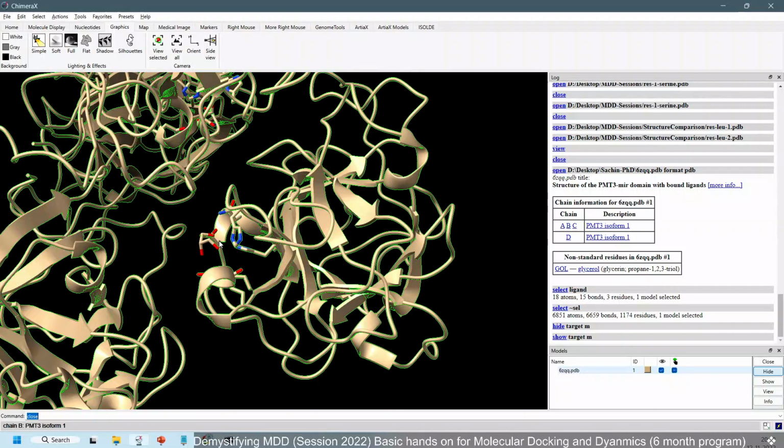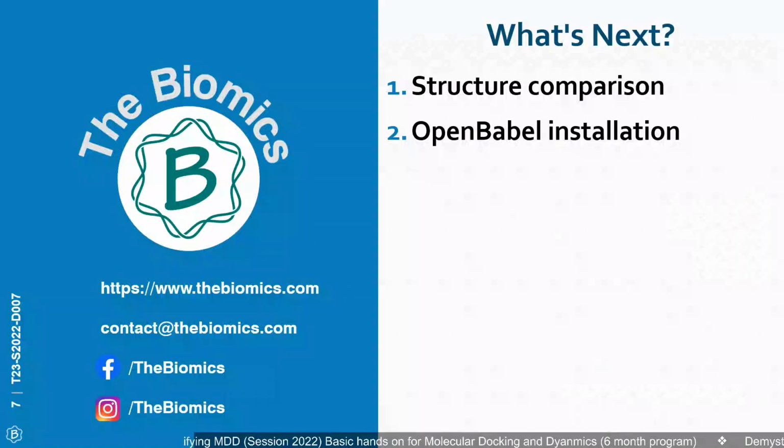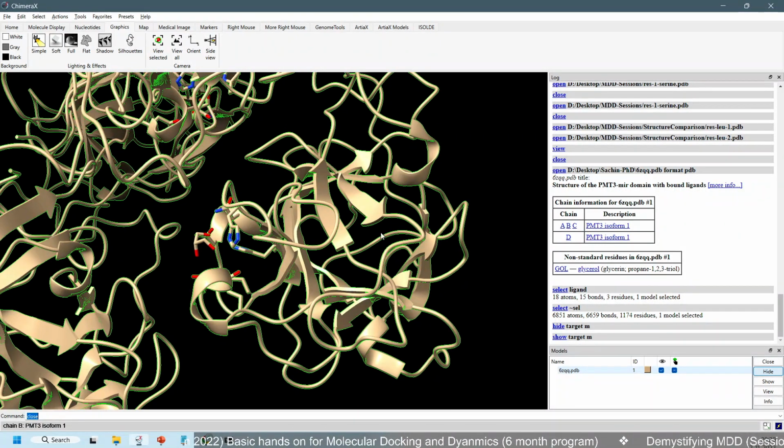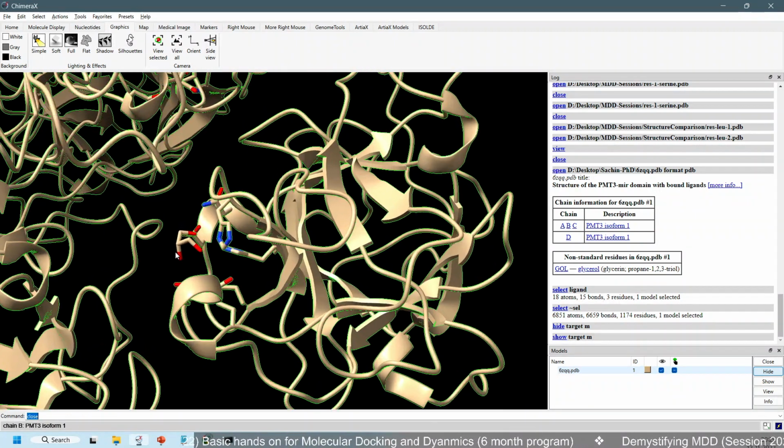That's why I think Vasu and me, who are using this older version, are facing the problem. Yes, I have installed the older version as well, and I will also be using the older version to demonstrate, because basic functionalities and names are the same in every version, just the GUI differs, and they are providing easier tools. So I will be using the older version as well from next time. Yes, sir. The newer version is very user friendly.